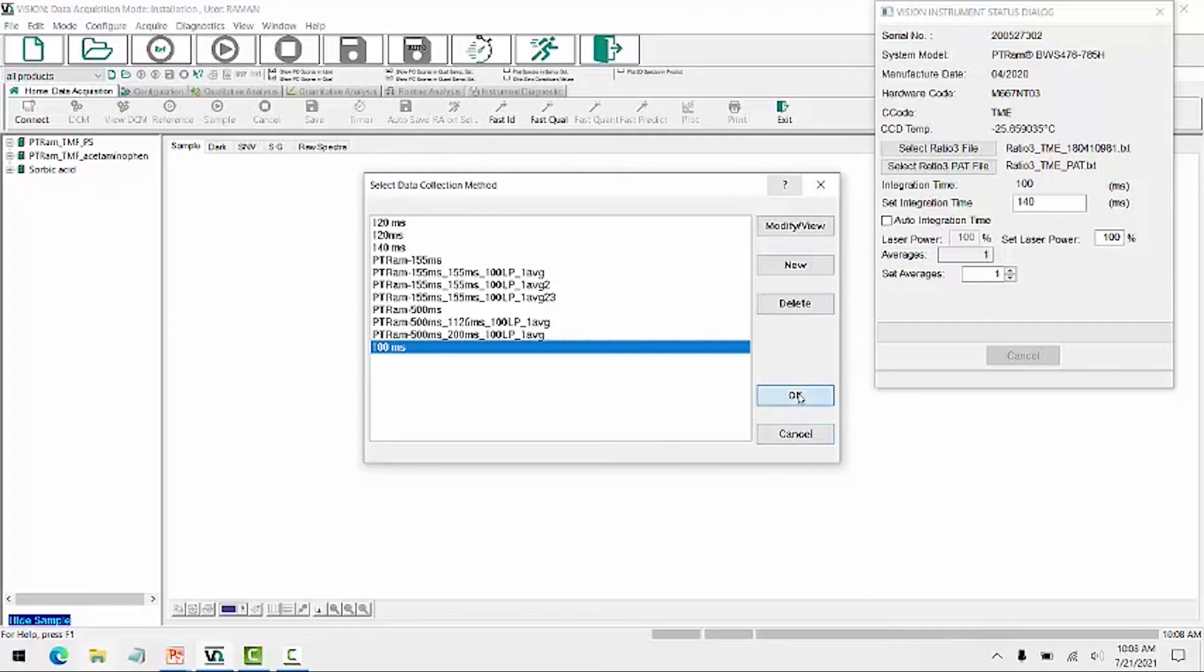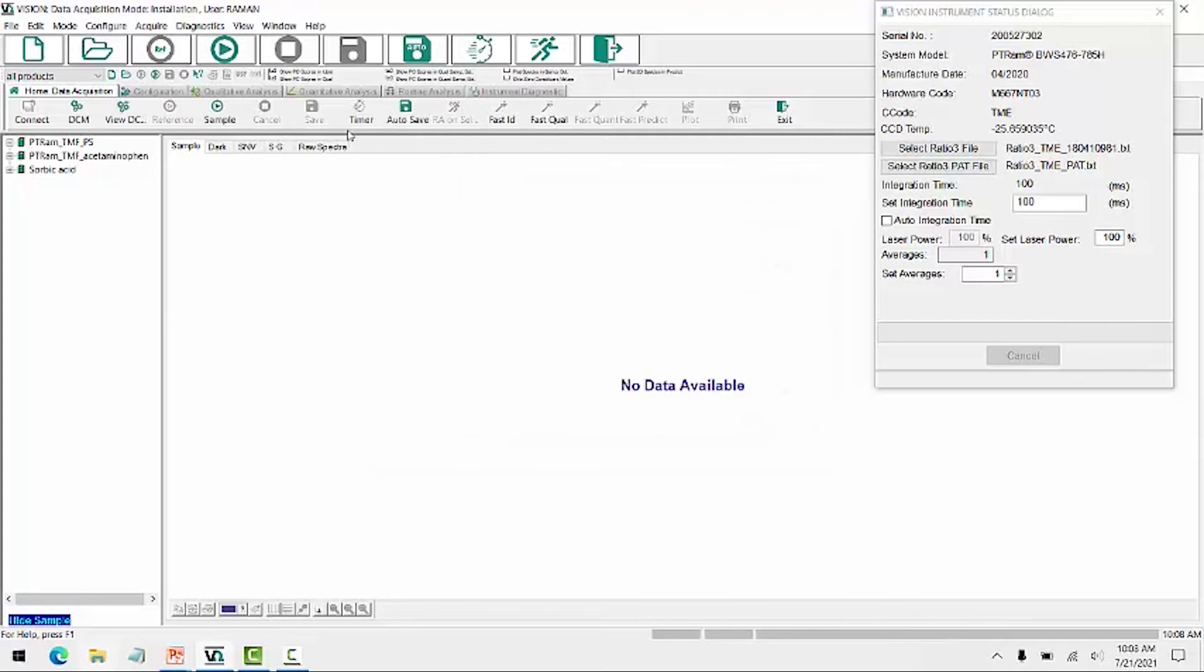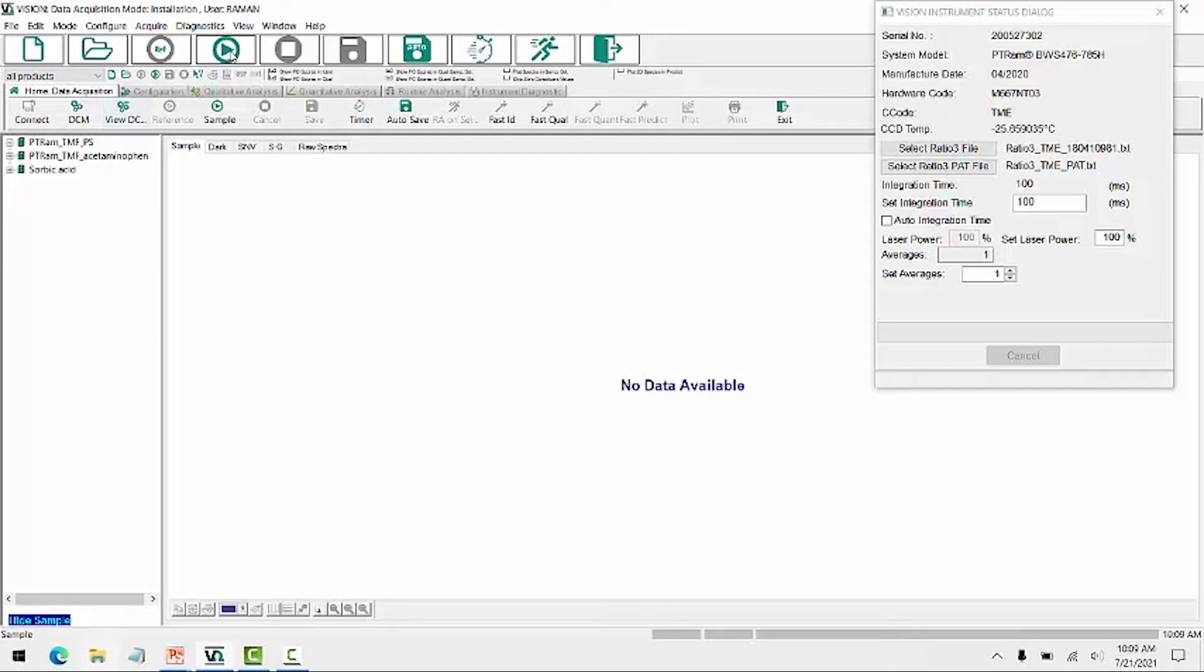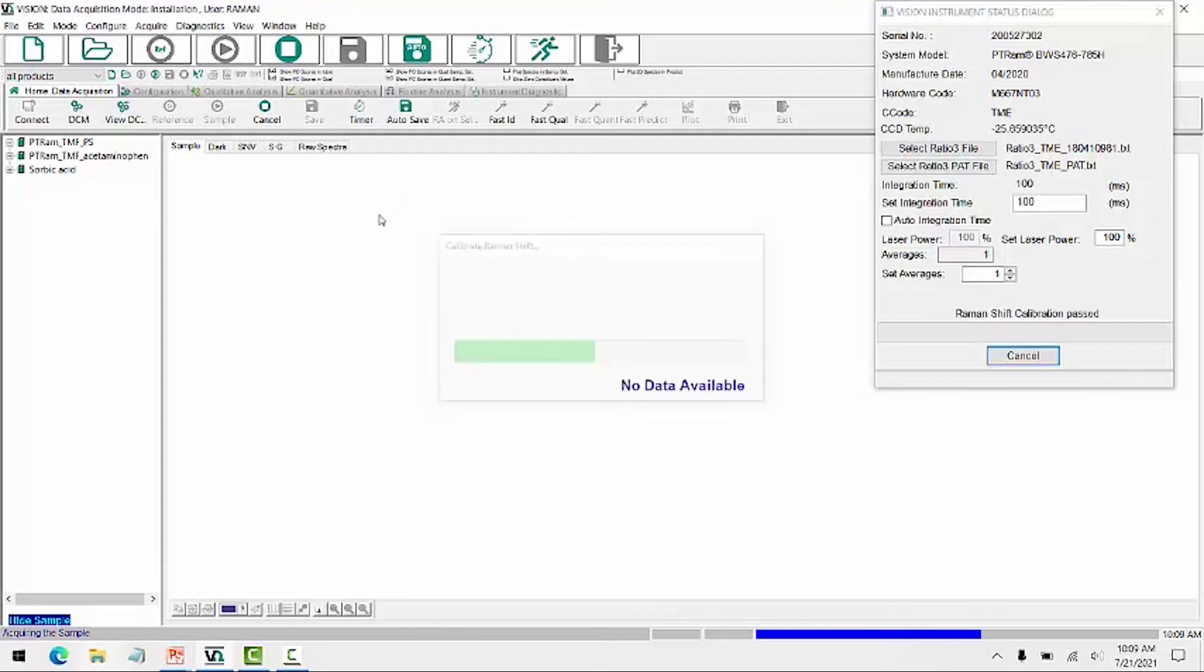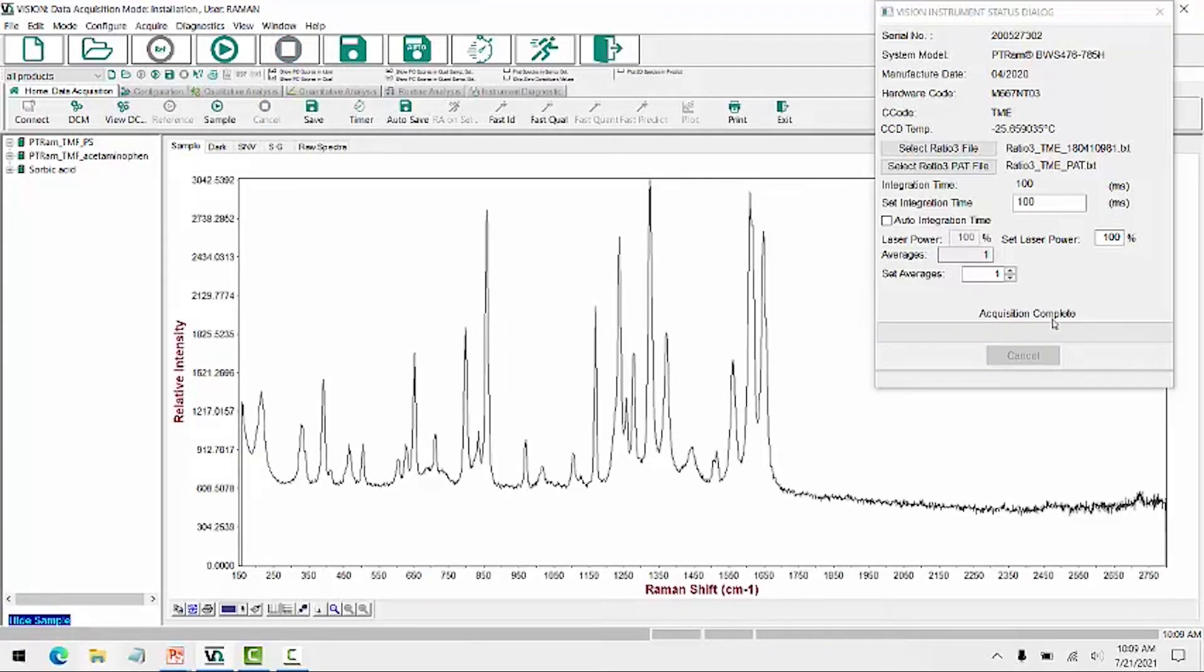Now clicking OK and OK, I can now collect a sample spectrum. I have a sample of acetaminophen that I will run. So I'm placing my sample probe against my sample, clicking scan. Because I have the PTRAM, it first calibrates the Raman shift, and then it's acquiring my reference or my dark scan and my sample scan, and you see my acquisition is complete. This is the spectrum of my acetaminophen.